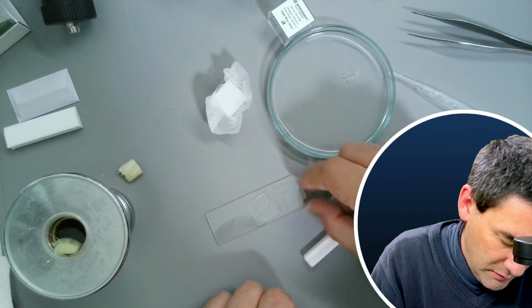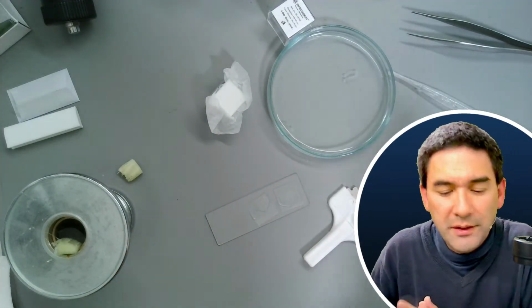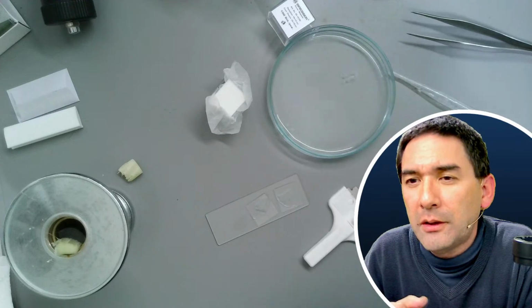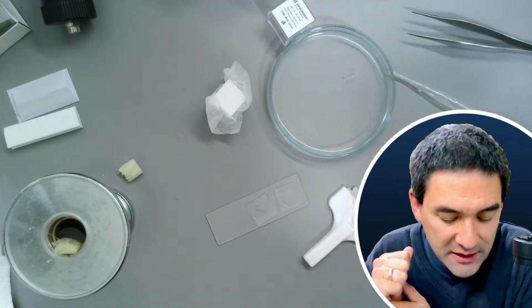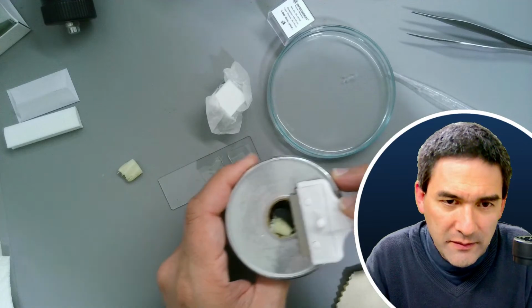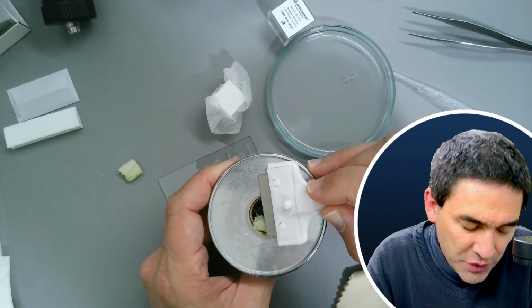And here, this looks a little bit thinner, okay, and everything goes under the microscope. But I think you can get a better cut by giving the blade a slight sideways motion while cutting instead of going straight. Yes, that is correct. So the idea is the following. I've been going across like this. By giving it a slight sideways motion, it might be possible.